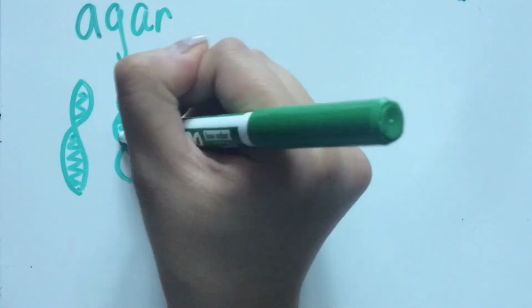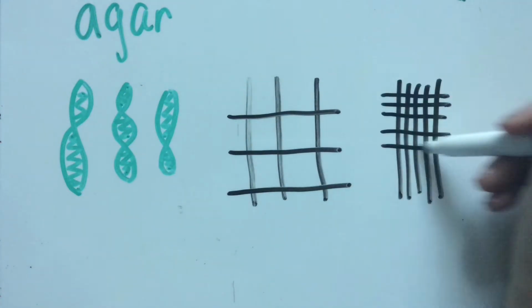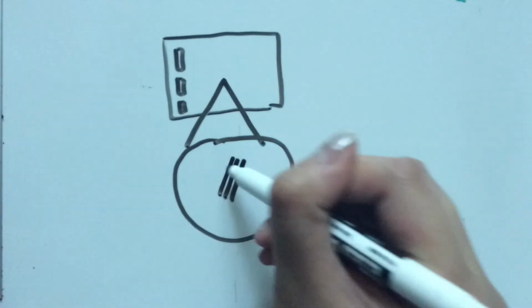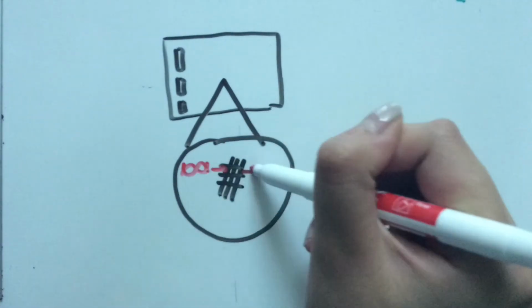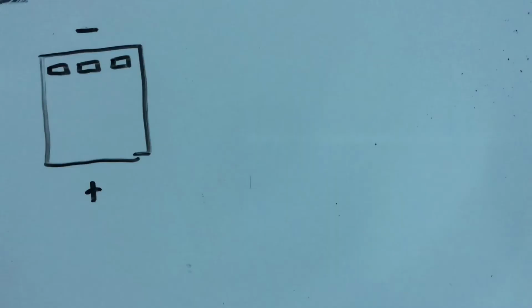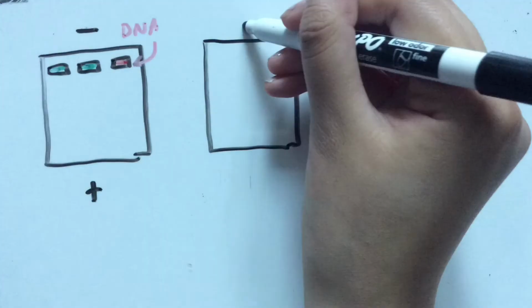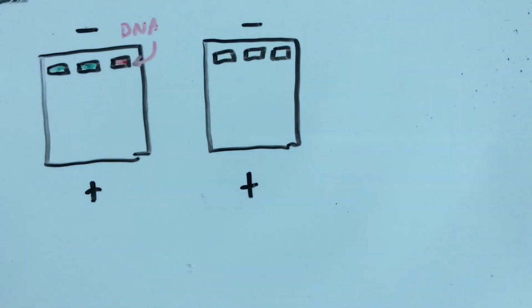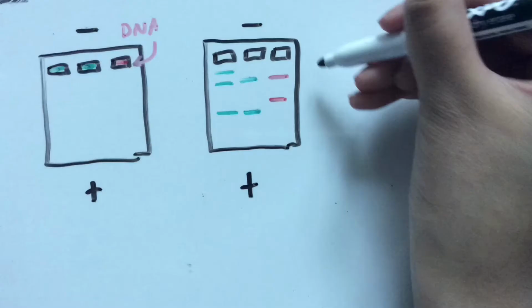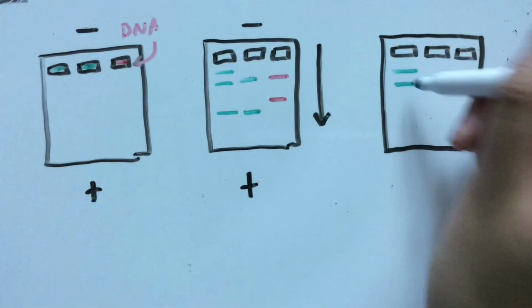Agar is a substance derived from seaweed. When an aqueous solution of agar and water sets, the agar forms a sieve with uniformly sized pores. The higher the concentration of agar, the finer the pores. The pores impede the flow of DNA, so smaller strands of DNA flow faster through the gel than larger strands. Therefore, with the same amount of current applied for a constant amount of time, shorter fragments of DNA with fewer nucleotides migrate faster towards the farther positive end than longer strands of DNA.